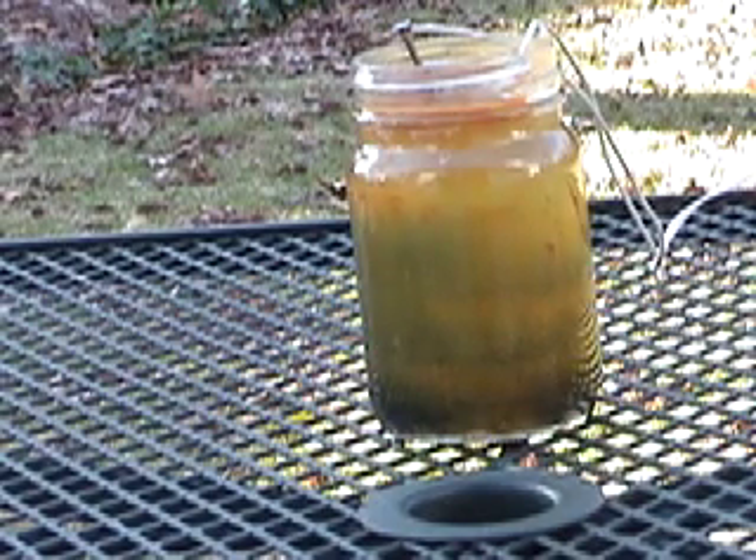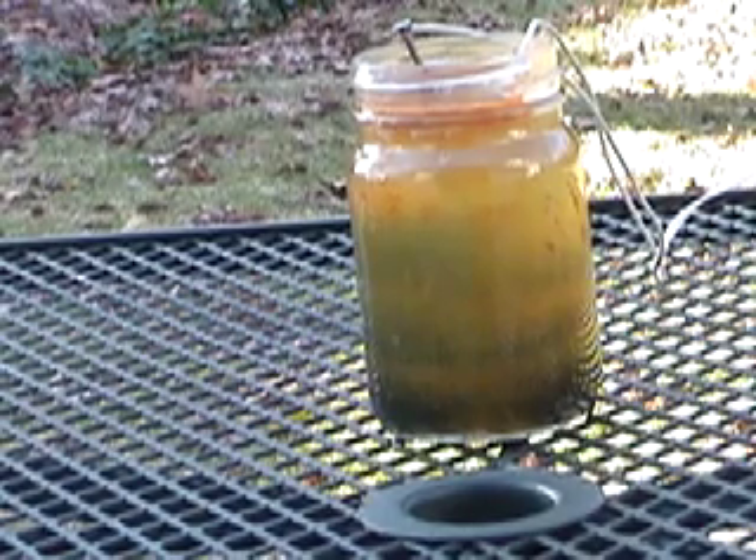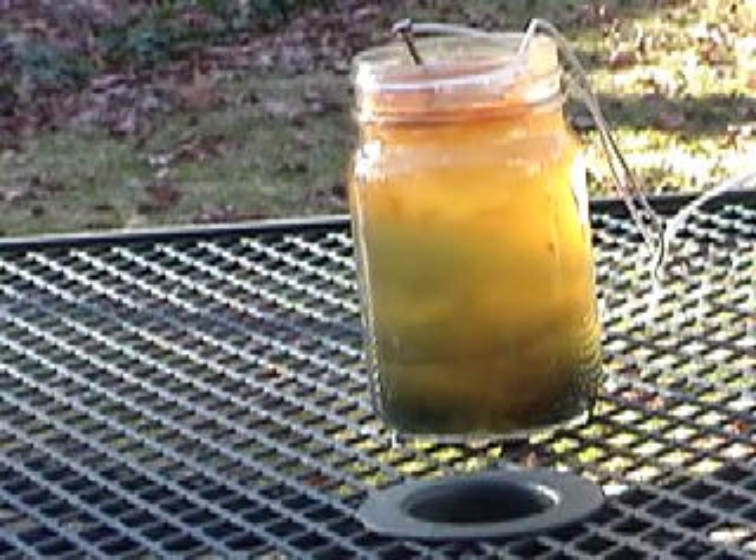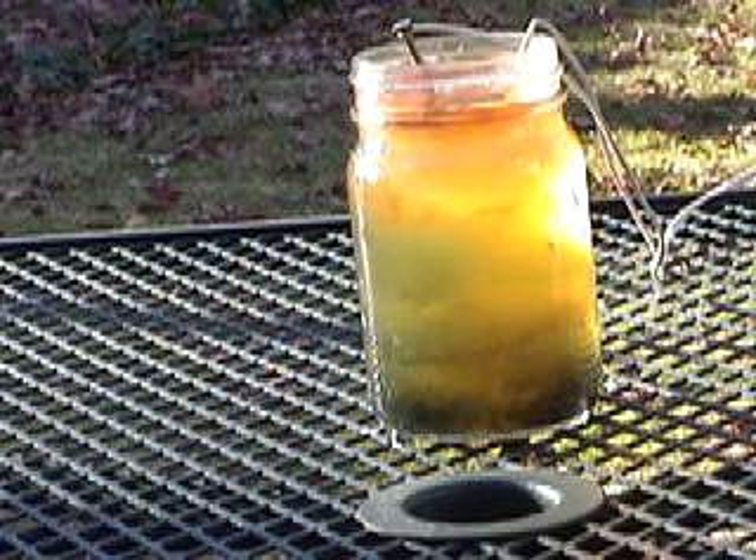Some common uses for red iron oxide include thermite mixtures, rock candy, and production of unique paints. This video was shot over a span of 52 minutes but was sped up so that you can see the whole process.